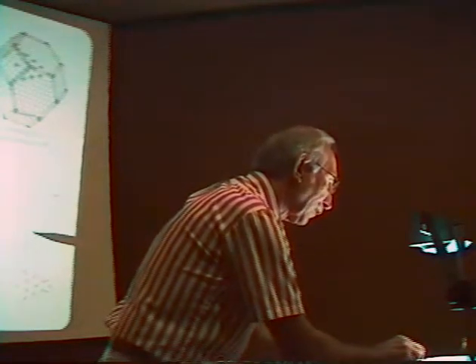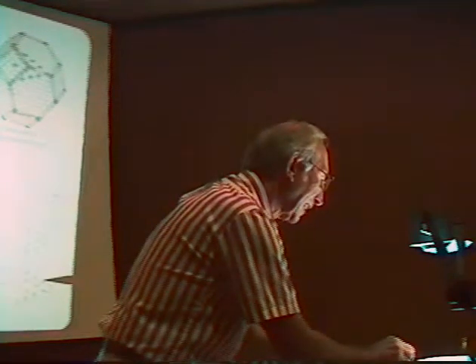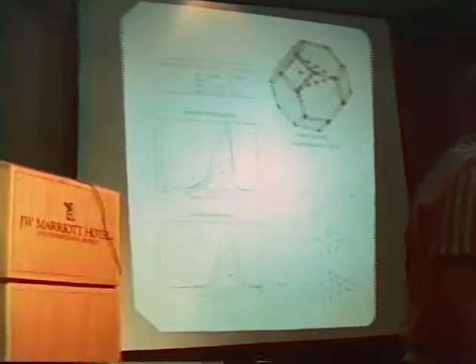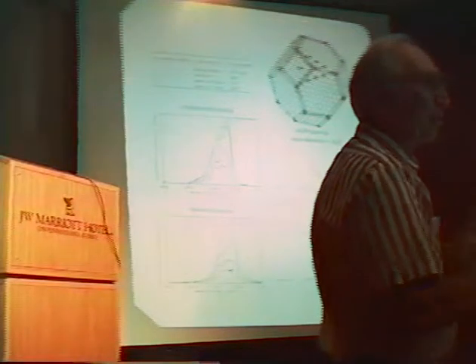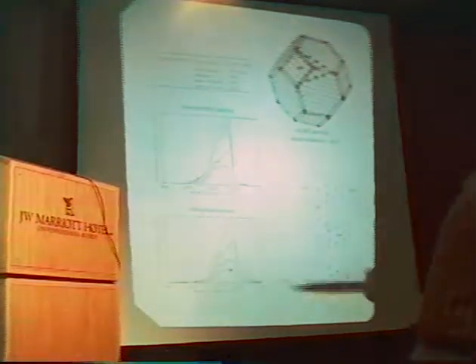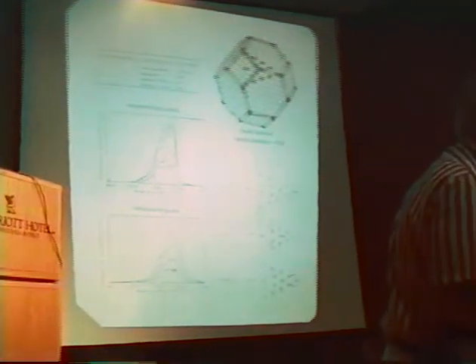This one comes from molecules on closely coupled edge atoms plus one in a 100 position that are oscillating together. And this one is a combination of molecules on 1-1-1 sites plus tightly coupled edge sites. The normal mode description tells us this. And insofar as we can reproduce these, we know what these bands come from.